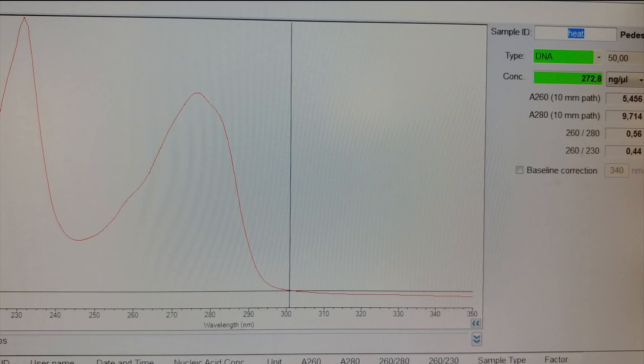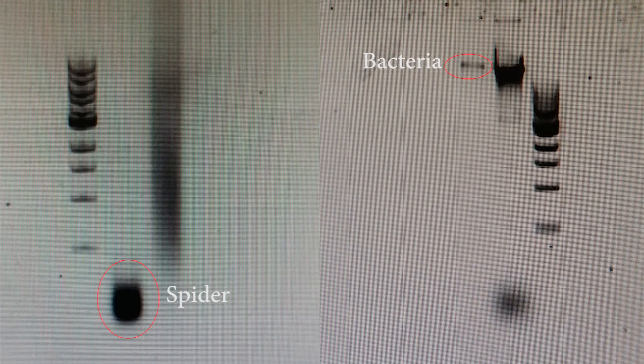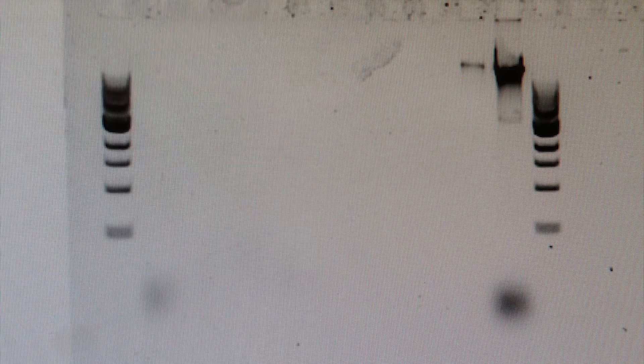The spectrometer said we had hundreds of nanograms of DNA, but when we ran it on a gel, there was clearly no DNA present. This is because the spectrometer can easily be set off by protein or other chemical contaminants left over from the extraction. We've since run both samples on a gel, and we finally got lots of DNA out of the bacteria and spiders. We actually saw the bacterial result in the gel doc video.